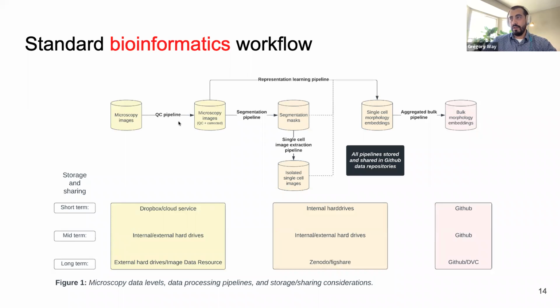And this is a rather new approach. So within the past couple of years or so, there haven't really been a lot of really great solutions for data storage. The data are typically large, anywhere between 500 gigs to 40 terabytes and higher. So there's quite a lot of considerations that you need to make when approaching and beginning an experiment to make sure that you have proper data storage policies in place.